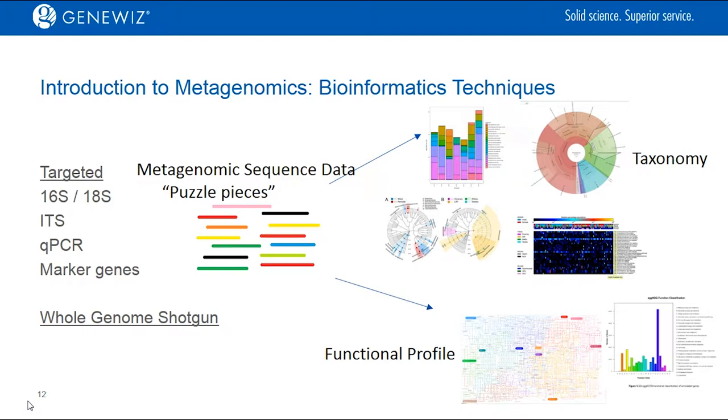So for the rest of the talk, I'll mainly be focusing on shotgun sequencing and analyses attached to this, because it enables us to look at any domain of microbial life like bacteria, protozoa, or viruses, while also enabling us to do functional analysis of the genes and biological pathways present. Shotgun sequencing also has better resolution than 16S at the species level, often even achieving good specificity to the strain level. Typically, when we talk about metagenomics, we're talking about shotgun sequencing, but amplicon sequencing is sometimes referred to in this manner.